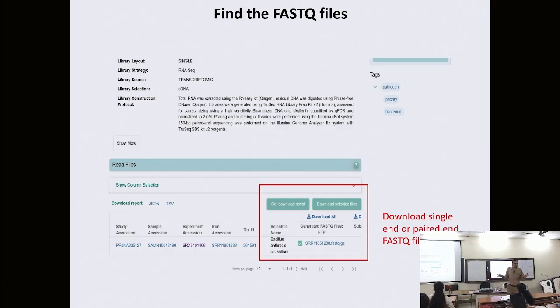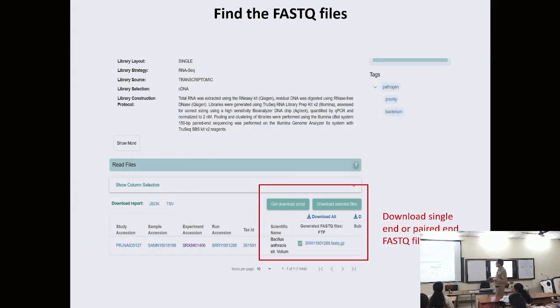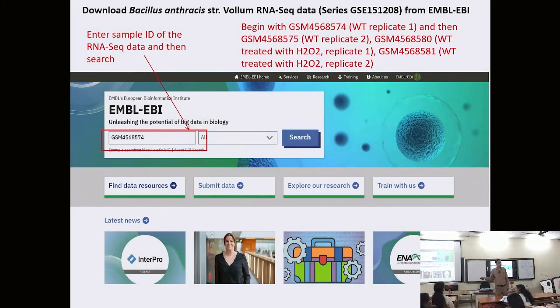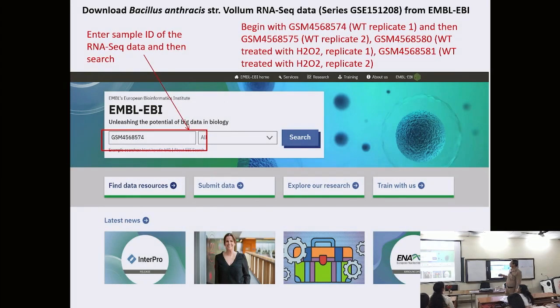Okay, so don't do it now, this is for homework, take home, because it will take a lot of time and these are very large files. So I just wanted to show you. And then once you have downloaded, you will download for each of these accessions. So you will download 4 FASTQ files, 2 for control and 2 for stress condition. Okay, and I have done some changes, so I'm going to send this file to Shravani, and she will forward it to you all.